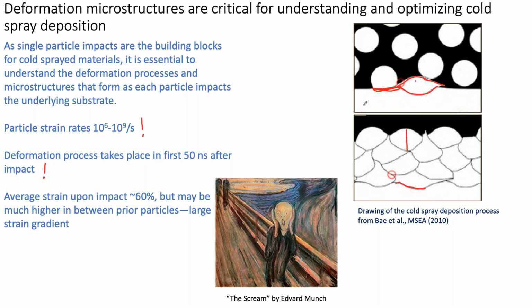But in all the work that I've done, I see crystalline material. The only time I have seen amorphous material was when we did that TEM work right at the interface between the aluminum and the steel. Like I said, it was about a 2 to 5 nanometer amorphous region. Interestingly, at the same length scale in the aluminum to aluminum interface impact, it was completely crystalline on both sides.